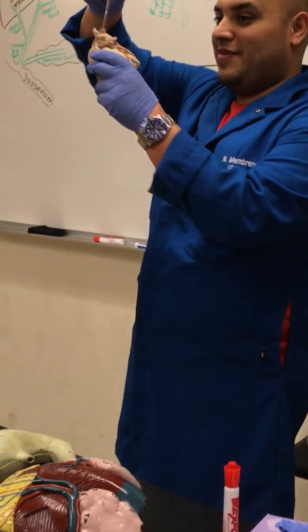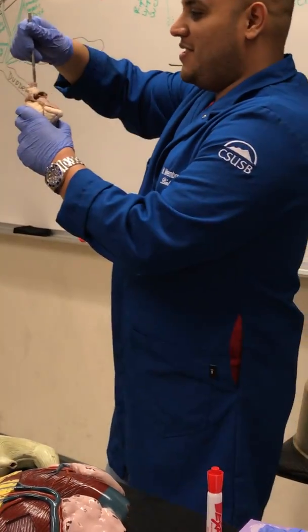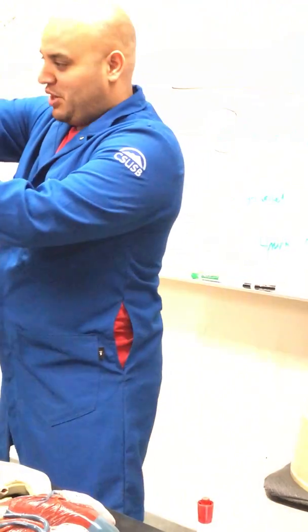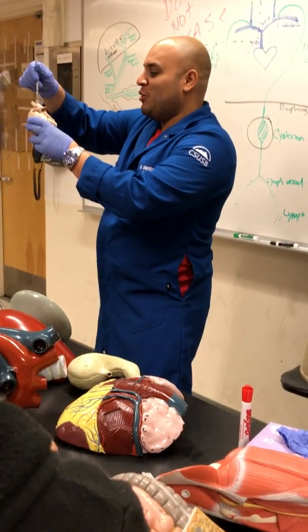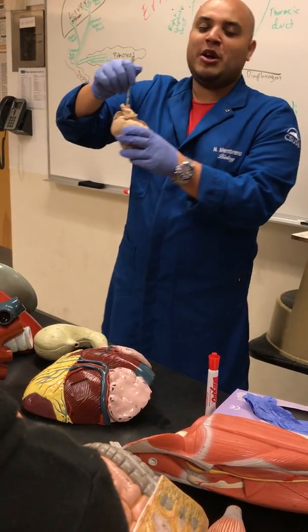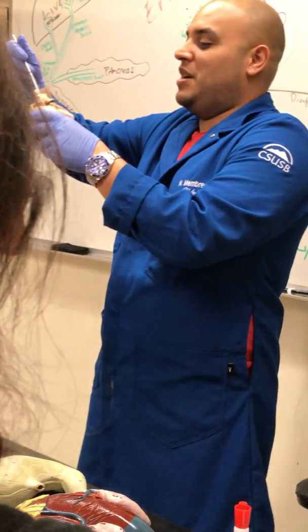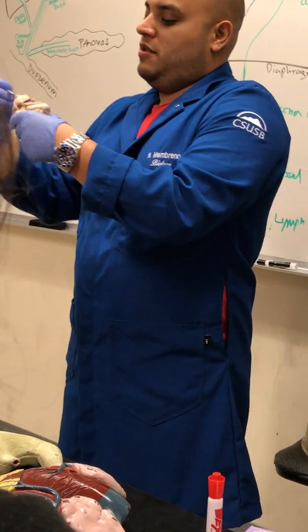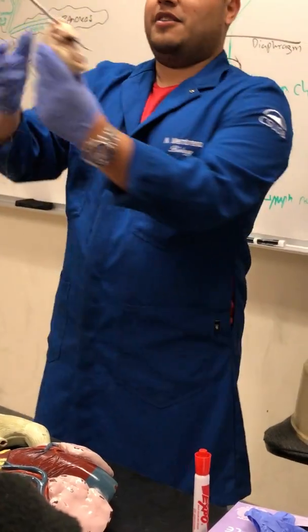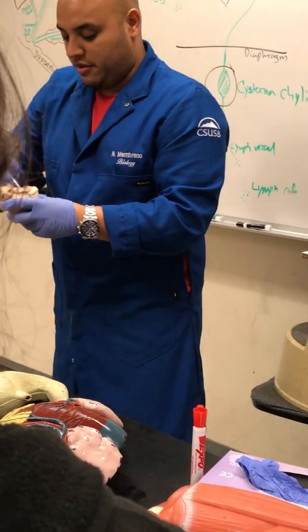What is this? Aorta? No. No, wait. Yes. Who said that? Brachiocephalic trunk. No one got it from my lab. Only one person from Nick's lab got it. But I showed you guys. Alright, this is the brachiocephalic trunk. Because of where it's coming out of, right there, that's the aorta. You see the arch going. It's how they cut it.